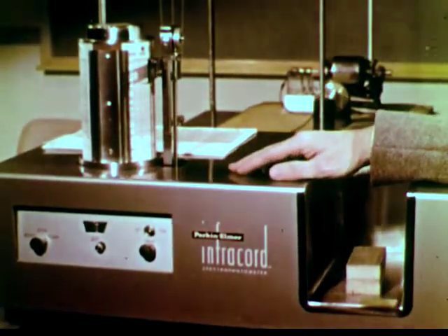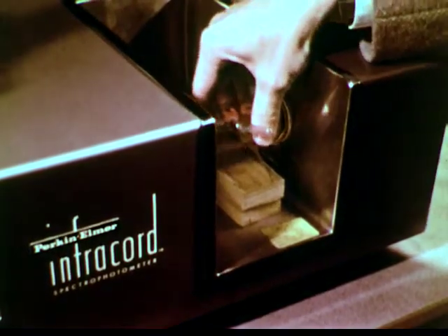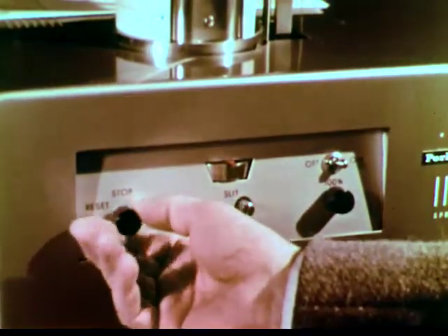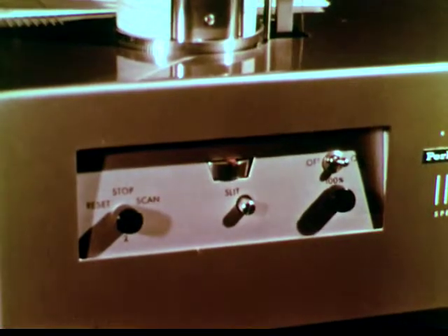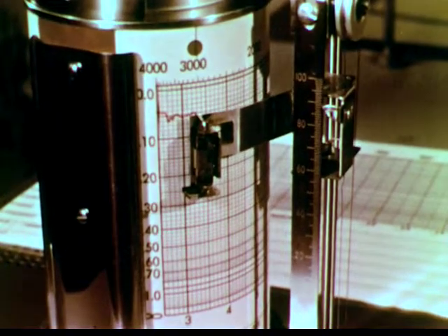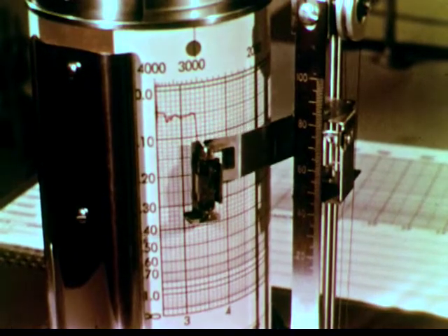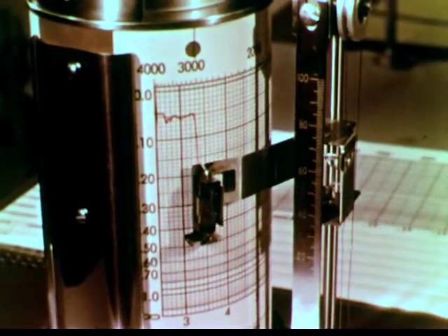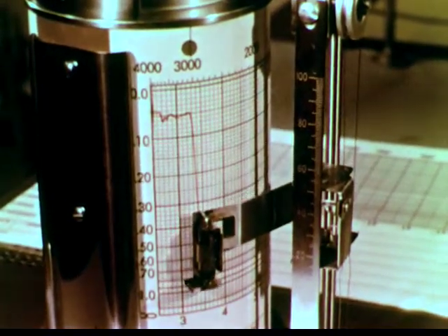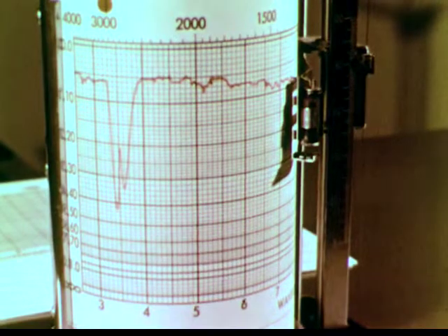For our first infrared sample, let's try a simple molecule, HCl in the gas phase. We start recording and scan to lower frequencies. The HCl sample is transparent at all frequencies until we get to 8.67 times 10 to the 13th cycles per second, where the sample absorbs quite strongly. The quanta absorbed have an energy of about 9 kilocalories per mole. At lower frequencies, the HCl is again transparent.